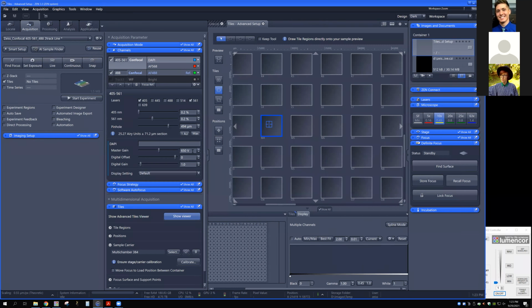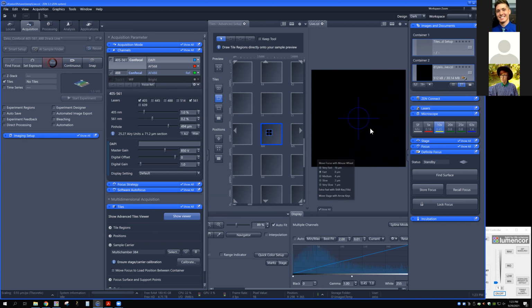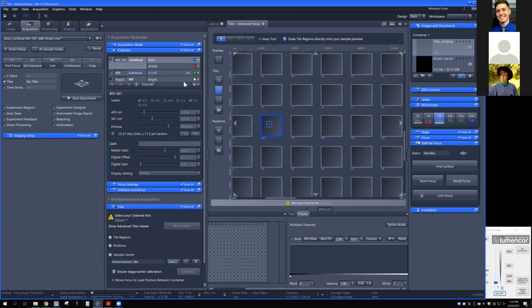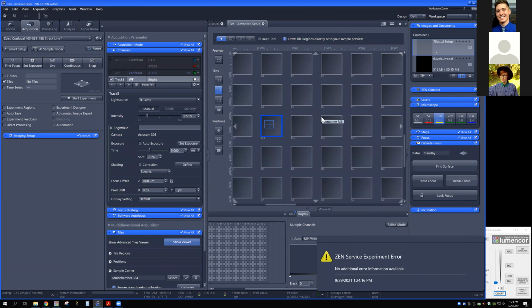That doesn't make... All right. Clicking too fast.